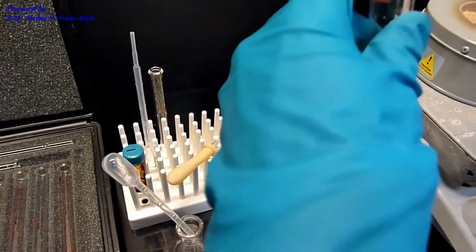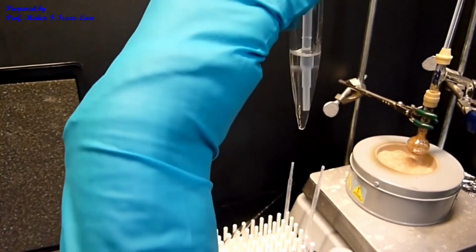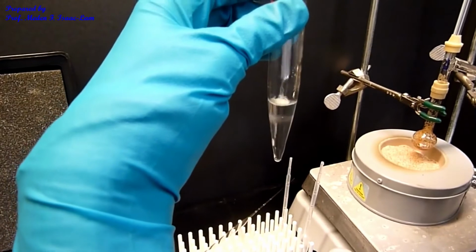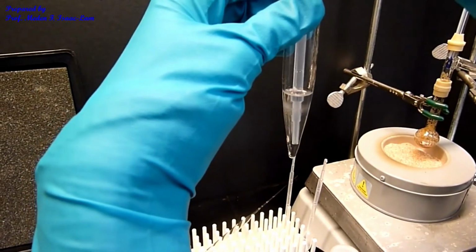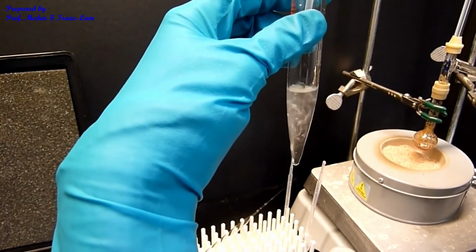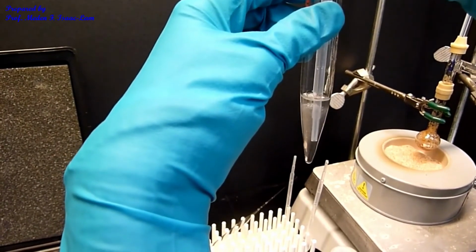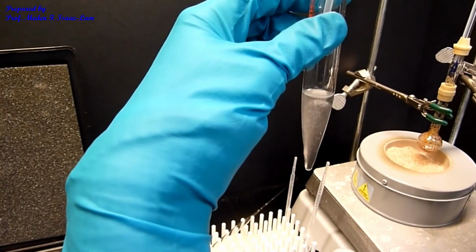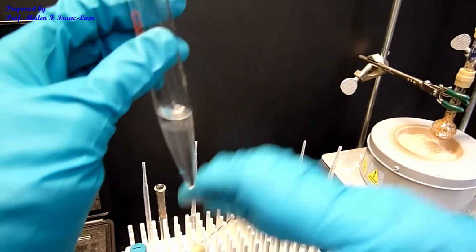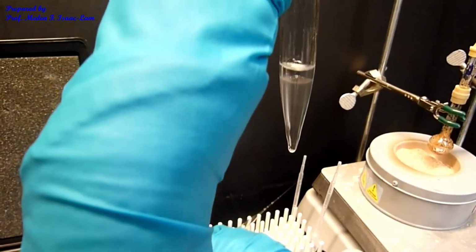And then I'm going to use this pipette to pipette up and down, just to mix it up. I don't want to vigorously shake it, otherwise sometimes it forms an emulsion. So I don't see any more bubbling. That means that, well, it's just a salt this time. So now I'm going to let it settle for a while, and then I'm going to get rid of the lower layer again.